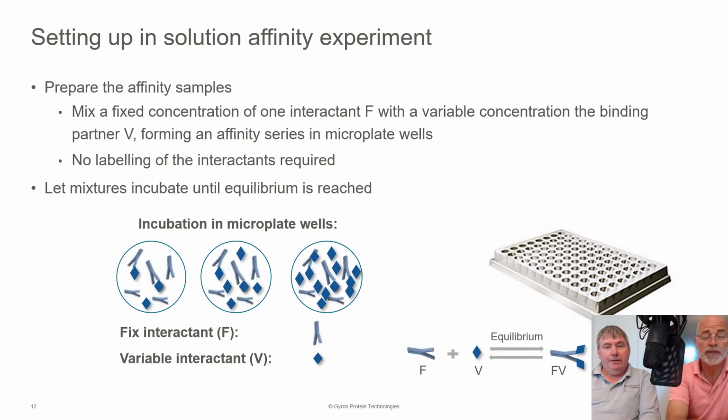And I think this is a place where it's helpful to know about the range of your KD ahead of time, but if somebody doesn't, they simply have to do an experiment with a screening at a specific time point, and you'll be able to see a rank order of your molecule KDs, and then can adjust as you want to refine what your KD measurement is. But if you just pick, say, an hour as an incubation time, as is often done, then you'll be able to screen a range of different compounds and then come up with an estimate of the KD, and then can refine that based off the data that you get from the earlier experiment.